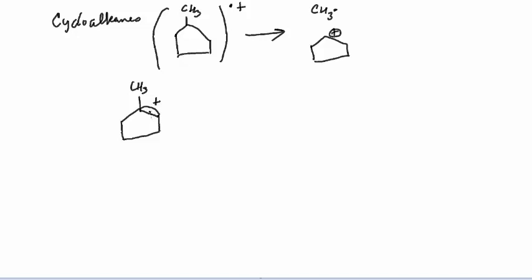This is a 1-electron bond. We're going to shift that 1 electron over to the adjacent bond, fully breaking that bond now. This bond here will break homolytically, so 1 electron shared moves over to meet this other electron and form a regular pi bond. The remaining electron, interestingly, we're going to come over and form a 1-electron bond between this carbon and that carbon.